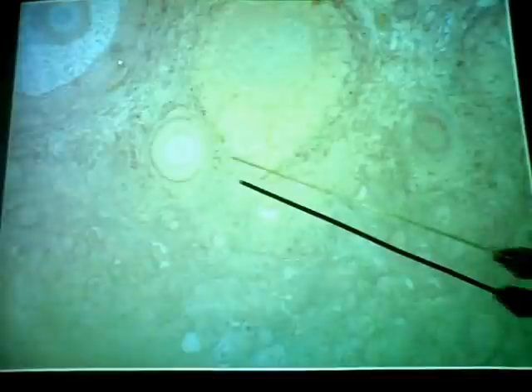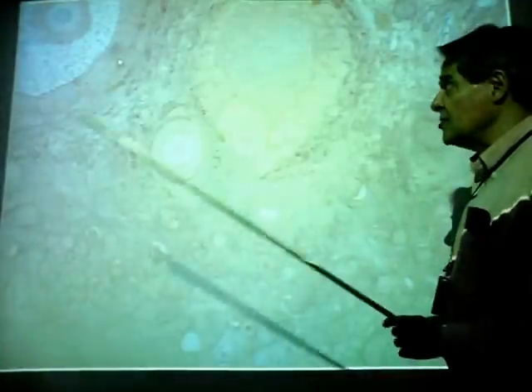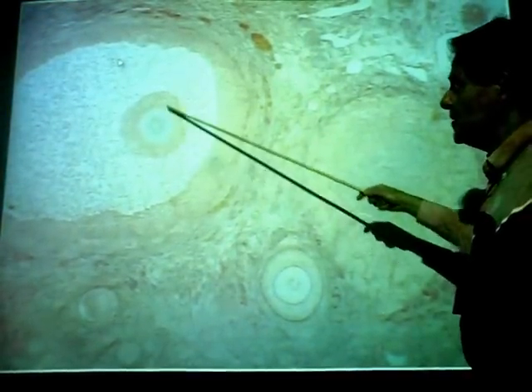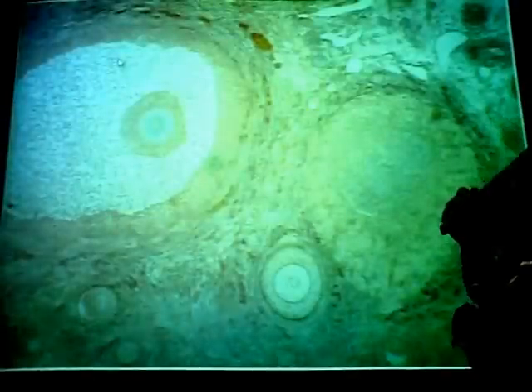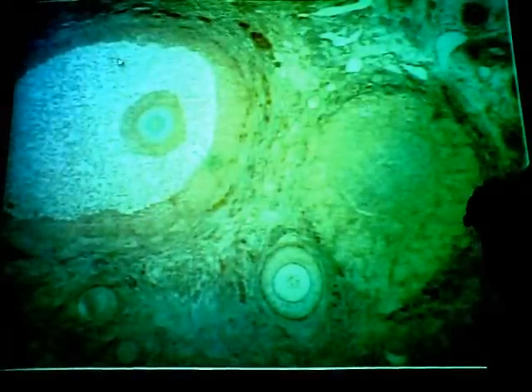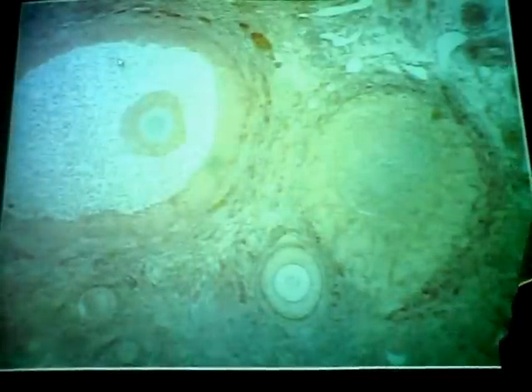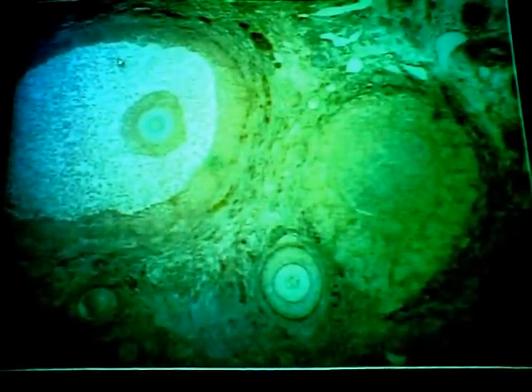All right, this then will develop into a much larger follicle called the secondary follicle. The secondary follicle is characterized by this fluid-filled cavity that we see here, and that cavity is called an antrum. And again, you can see the egg cell right here, nucleus and cytoplasm. And here are some cells of the follicle that remain with the egg cell. It's called the corona radiata. And that's one of the things the sperm cell has to penetrate to get into the cytoplasm of the egg cell to fertilize it. And that's why it needs those digestive enzymes in the acrosome to basically digest its way in.